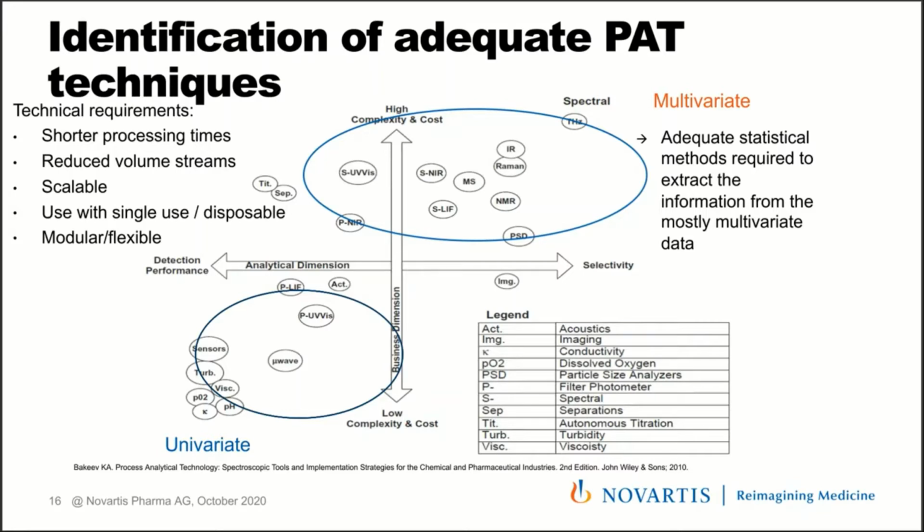If we look at UV-Vis spectroscopy, most spectroscopy methods are in this region. We found that the statistical methods have really developed in a way that can be user friendly and accessible for the majority of customers who will use them. The techniques are also automated, especially nowadays. The focus in our company also goes in this direction.